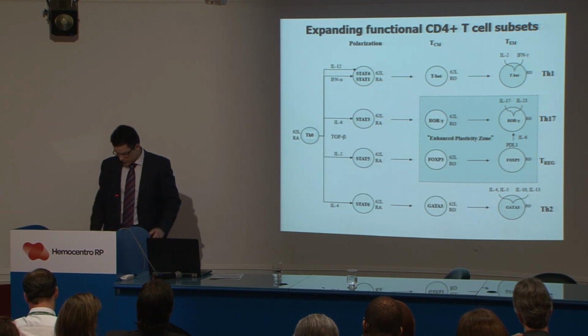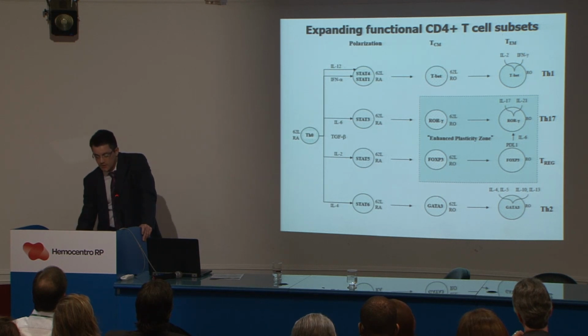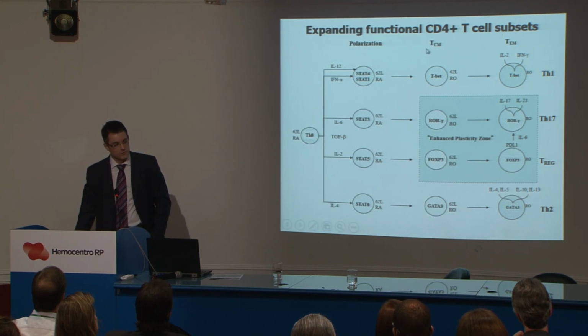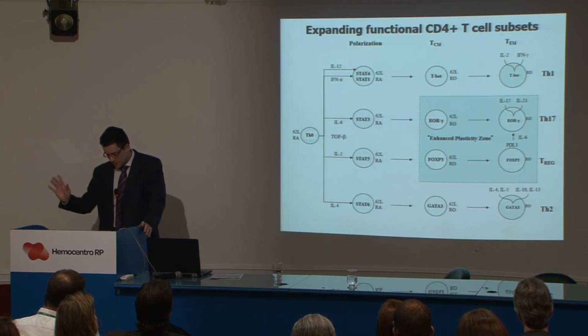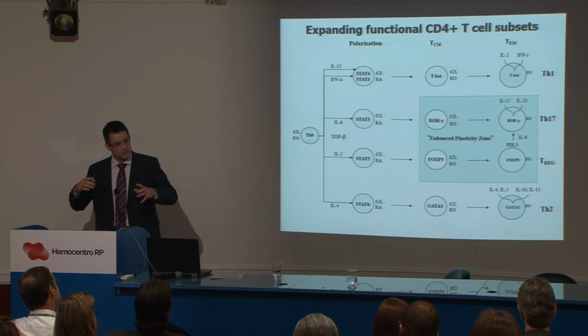So just moving a little bit forward, but I want to stay a little bit close, because I also want to say if you stimulate these cells very harshly with a high dose of IL-2, you can promote T effector memory cells. But if you don't do that very strongly, you can have central memory cells. I'm not going to talk about stem cell memory. It's another chapter, much more detailed. But just to know that all these variables are together, interleukins, intensity, dose, and everything, to have the cells that you want to work with.